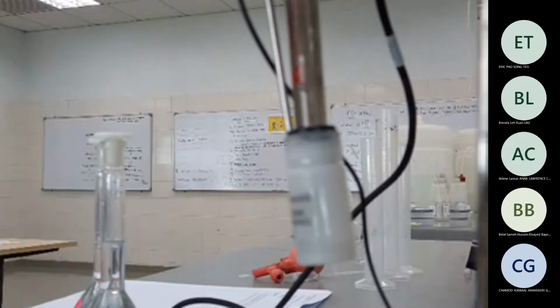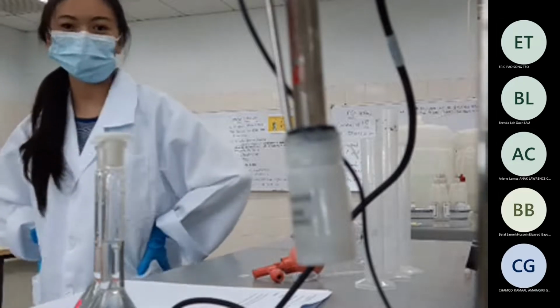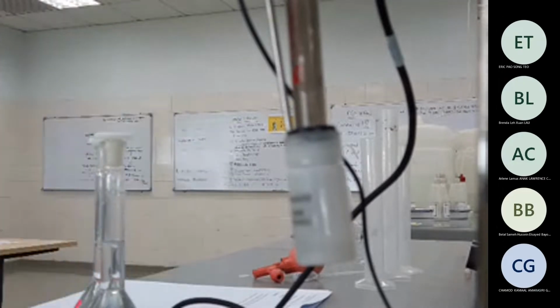So have you rinsed it with the distilled water? Do faster. We just have 1 hour to finish, less than 1 hour actually. How long do you think the second experiment will take? It will take long if you do not do it faster. Okay, so we start the pH meter, plug in the pH meter.